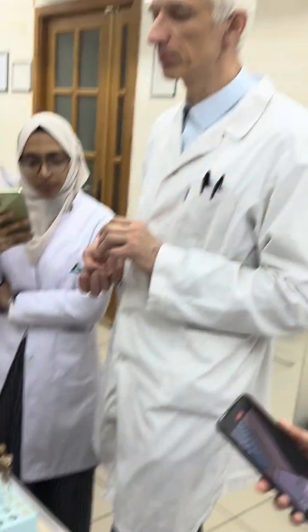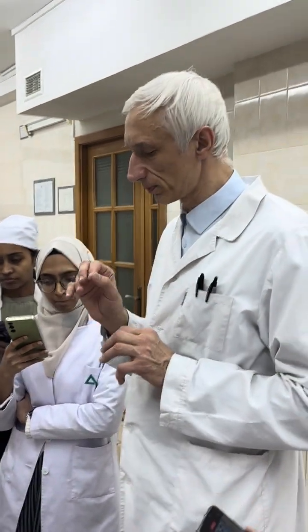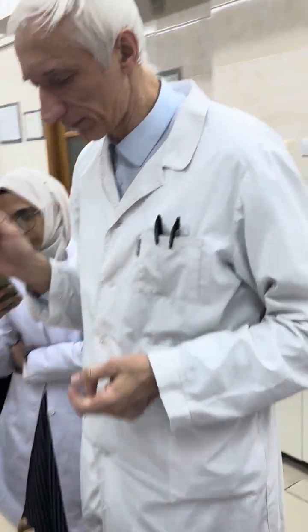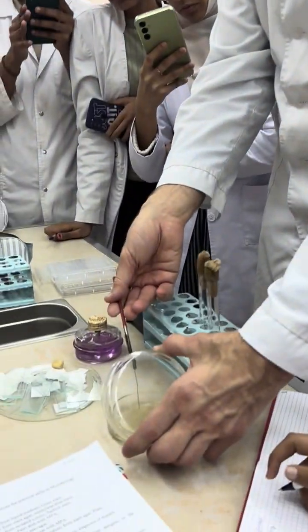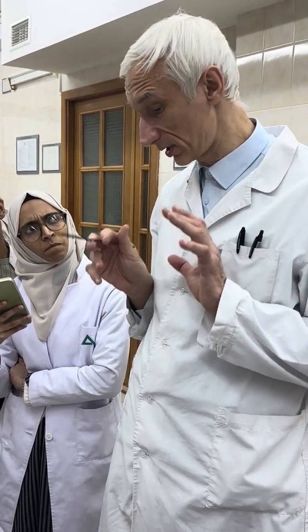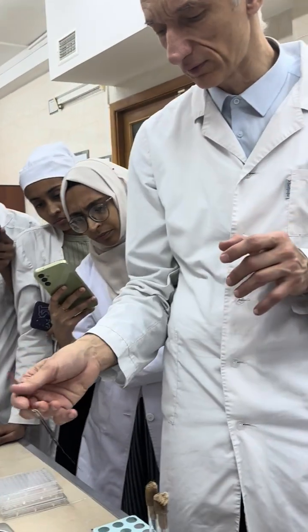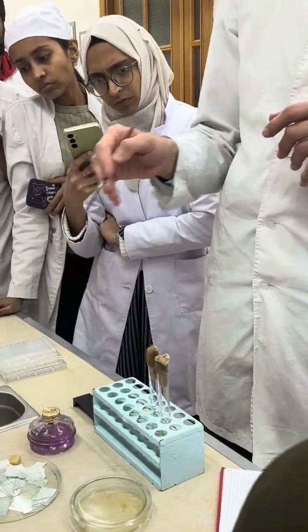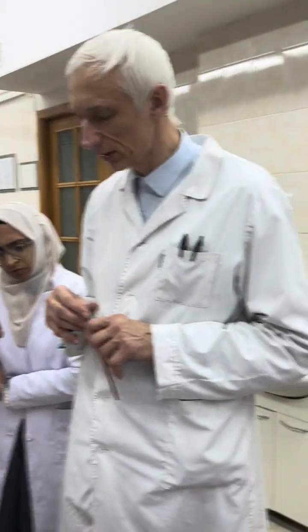The slide will be made totally like in the previous case. A drop will be prepared. Now, how to take the material from this colony: after sterilization, cool the loop. Standard situation. And then it's regarded as a good approach to scratch half of the colony, not the whole colony, because the rest of the colony should be retained for other experiments if necessary, or in the case of an unsuccessful slide making. Scratch the colony, put it into the drop on your slide, spread and do the same. Okay? Let it be so.